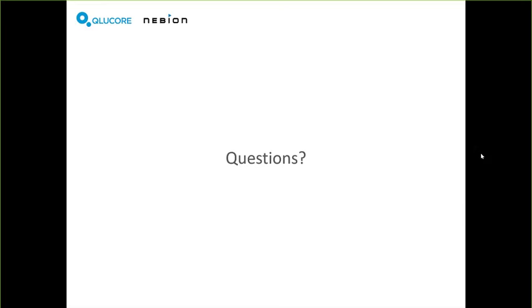You can also add annotations to an already existing data set. It's all text-based. We will pull in whatever information you give us. So it's very straightforward. I hope that answered the question.